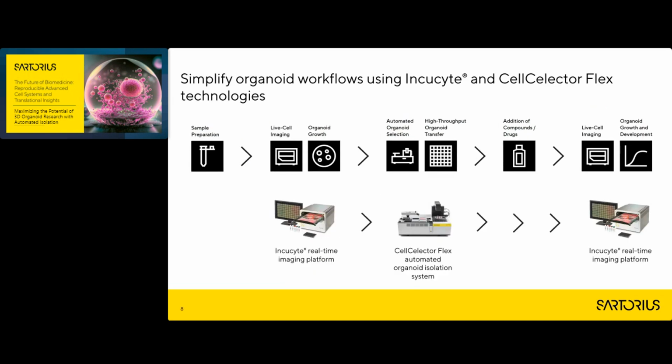Organoid research and workflows can significantly benefit from automation. Automated imaging systems, for instance, can continuously monitor organoid growth and provide real-time data on changes in size, shape, structure, and behaviors of the organoids. This not only allows for more precise tracking of the organoid development, but also enables early detection of any abnormalities. Screening various compounds can be extremely expensive, so detecting any deviations from normal growth profiles can save a significant amount of materials and costs.